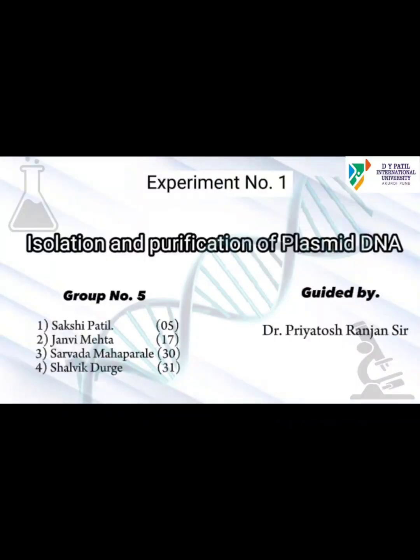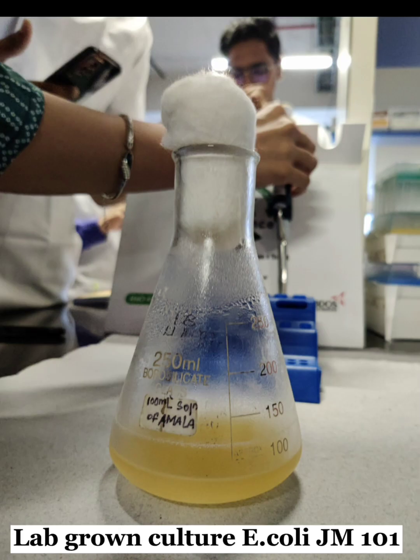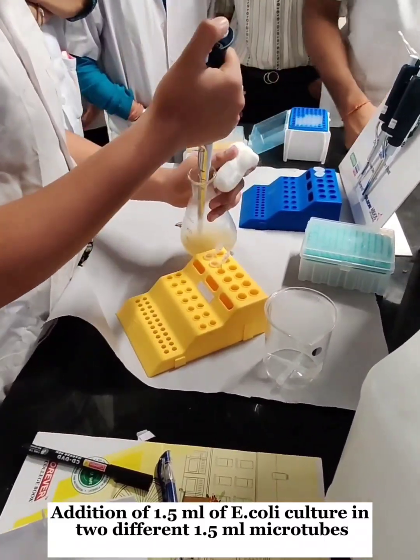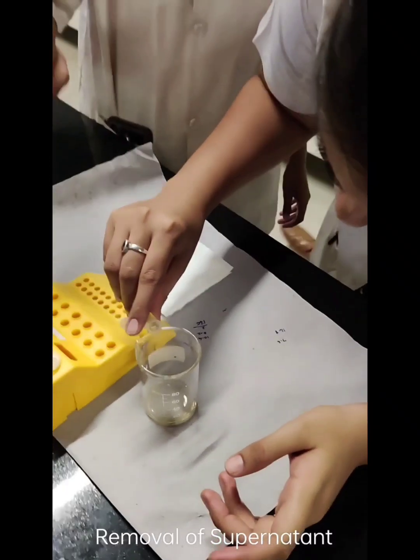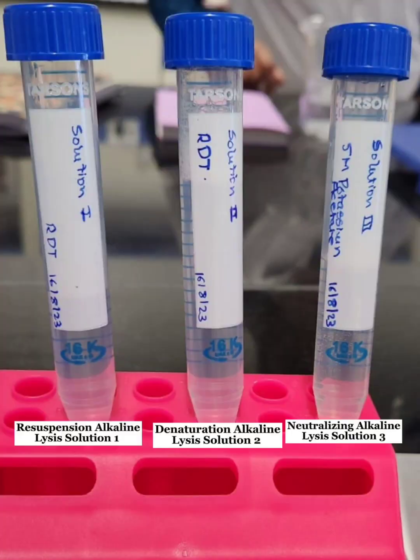We isolated and purified the plasmid DNA using the alkaline lysis method that involves 3 buffers: resuspension, denaturation, and neutralizing to extract the plasmid DNA from the E. coli cell membranes, taking 1.5 ml of culture in 2 different vials. We centrifuged the tubes at 10,000 rpm at 15 degrees Celsius. Then we carefully removed the supernatant.